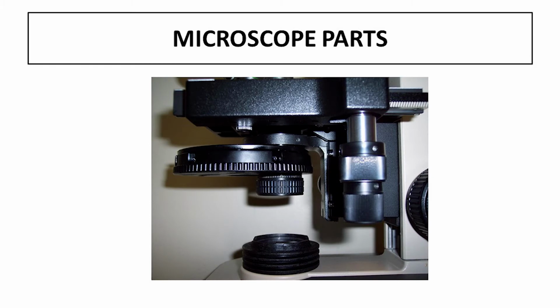Underneath the mechanical stage and right underneath the condenser, you can see this other dial. That is the iris diaphragm. It is exactly what it sounds like. It is an iris. It opens and shuts. It sometimes helps visualize bacteria where you have a hard time distinguishing the edges or getting a really sharp image. If you play around with that a little bit, it works out great. The other settings for the condenser we're not going to touch, so make sure you leave those alone.